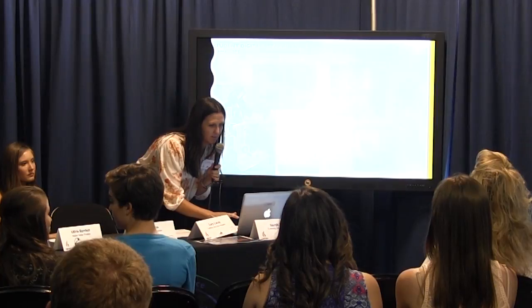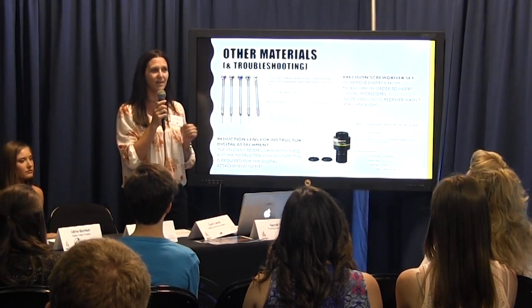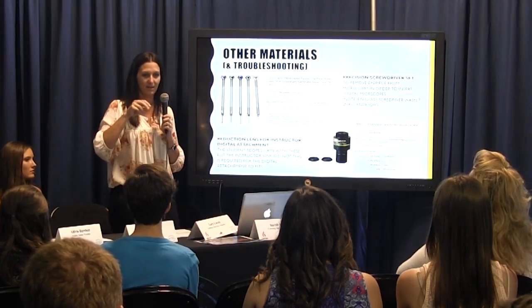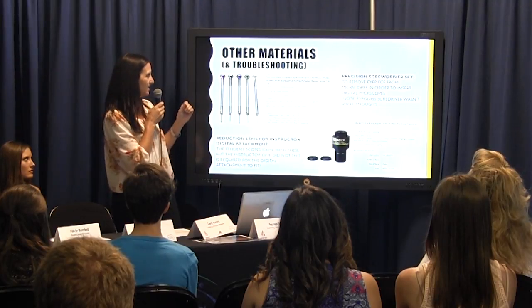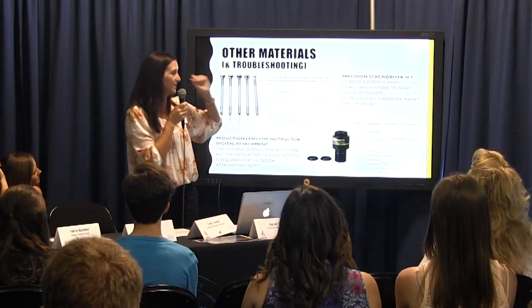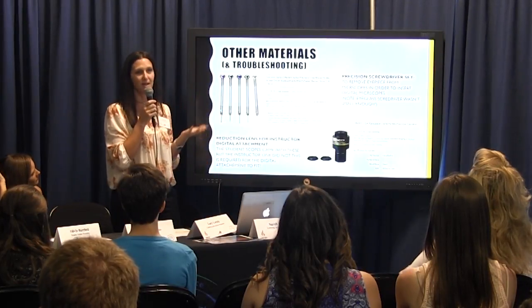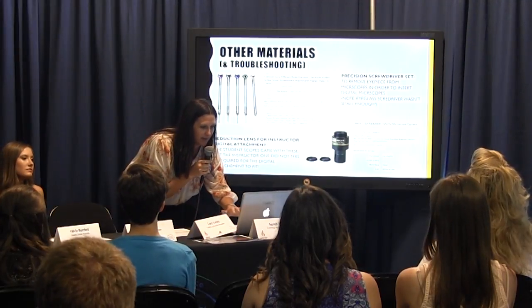All right, I need to move a little quicker. Okay, troubleshooting took me a while when I got the equipment. It didn't come with any instructions, basically figure it out yourself. One obstacle was removing the ocular lens, the eyepiece, because it took more than I had. The eyeglass screwdriver wasn't small enough, so I had to order those. And then the teacher one wouldn't fit in there, so I had to buy an attachment for that. And of course, I don't know anything about microscope repair, so I was just trying to figure that out.